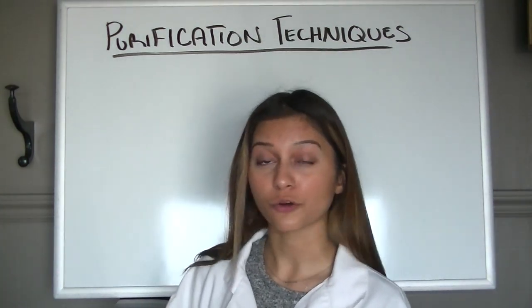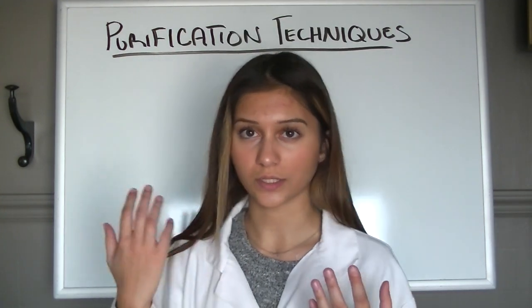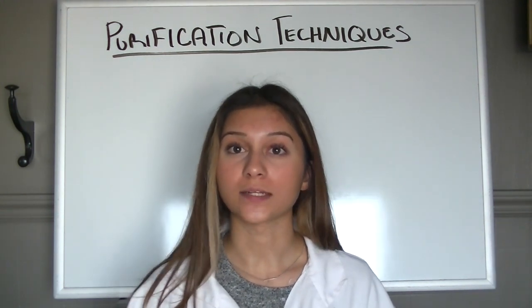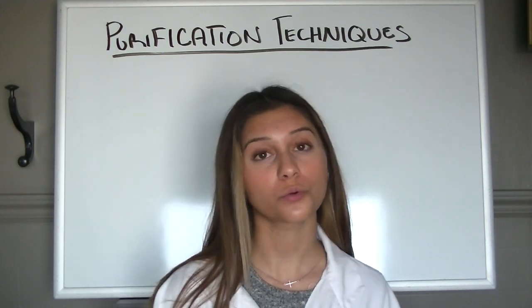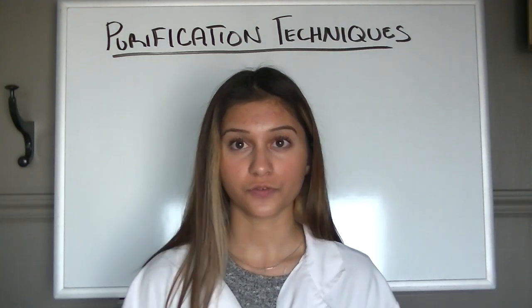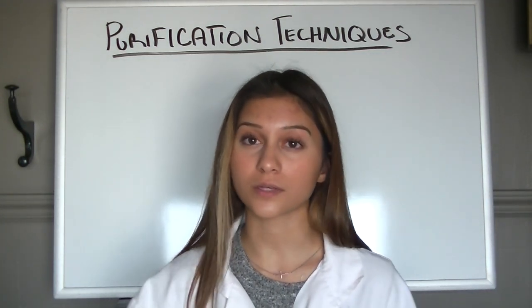Next, we will discuss chromatography. Within chromatography, there will be a stationary phase and a mobile phase. Compounds can travel from start to end at different rates. This all depends on whether they stick in the stationary phase or they float along the mobile phase. The chromatography techniques that were used for purification for these labs were thin layer chromatography and also gas chromatography.